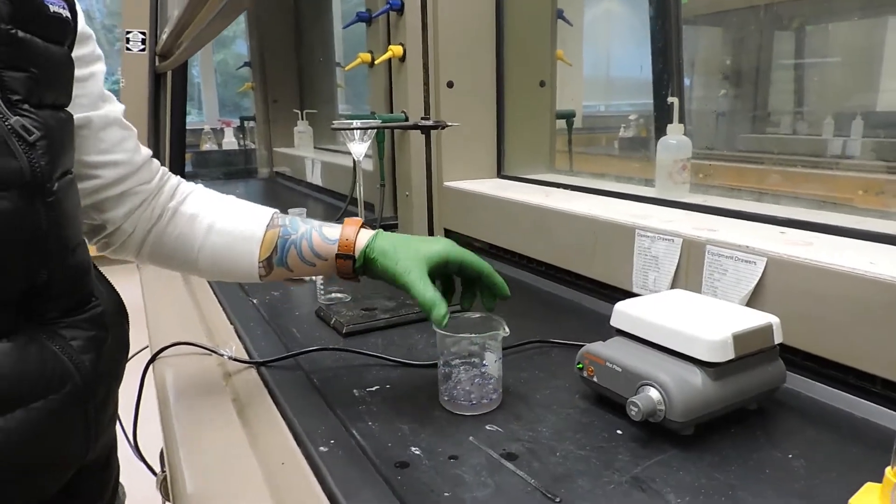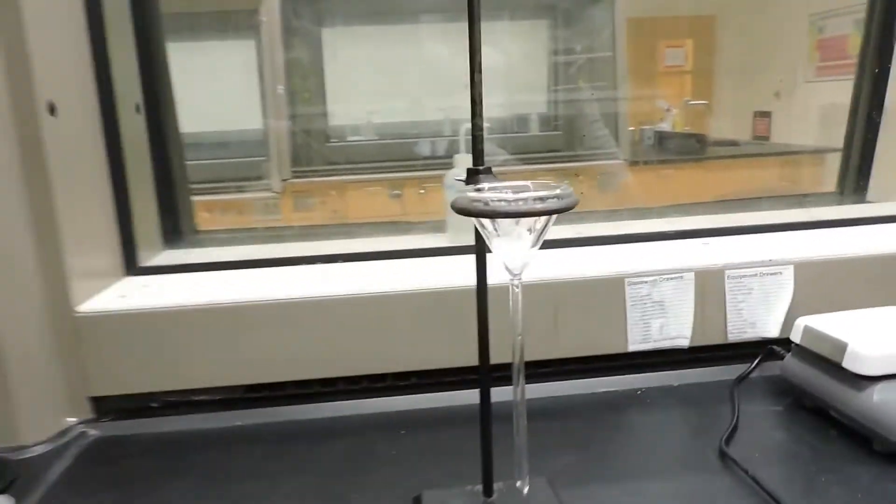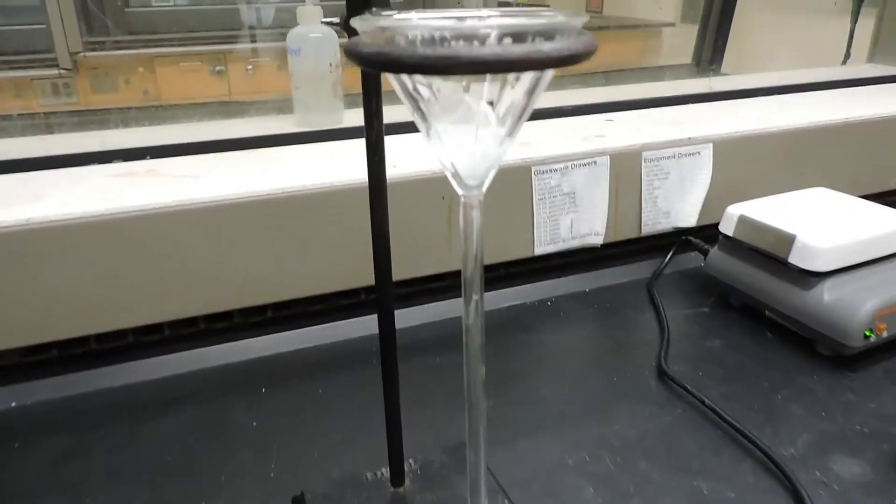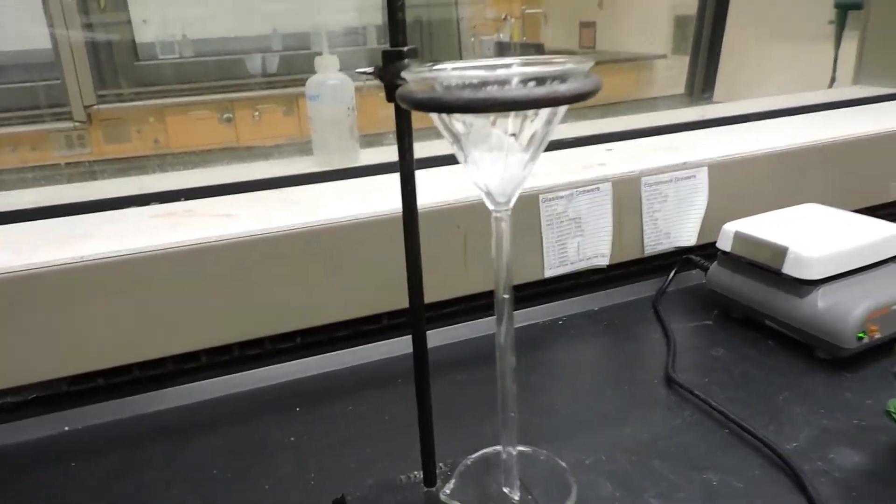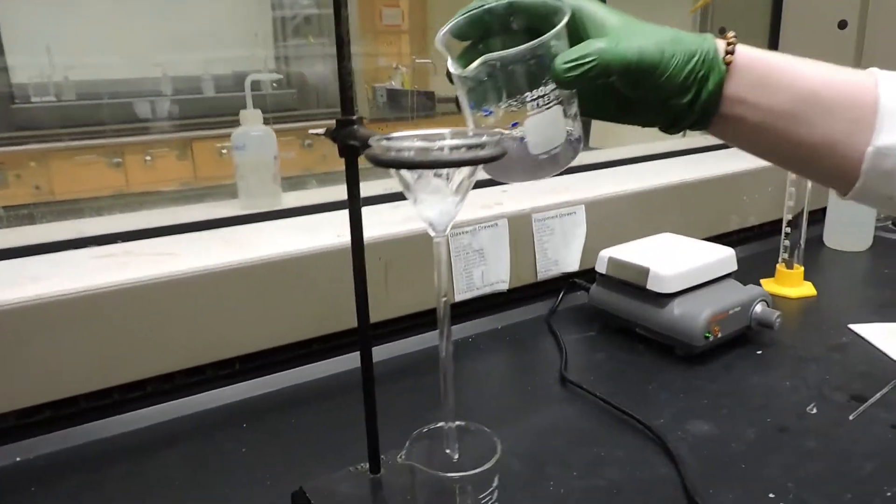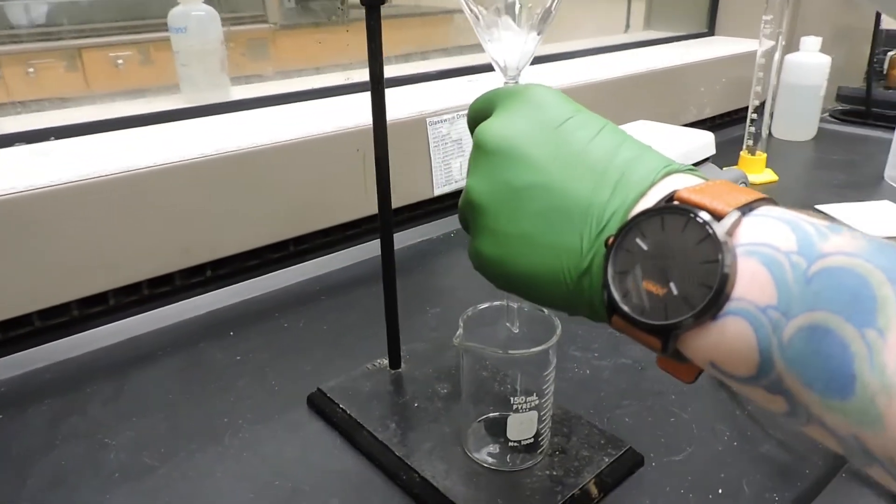Now we have set up a funnel in an iron ring with some glass wool inside to filter our mixture, and we're going to do that into a 150 milliliter beaker.